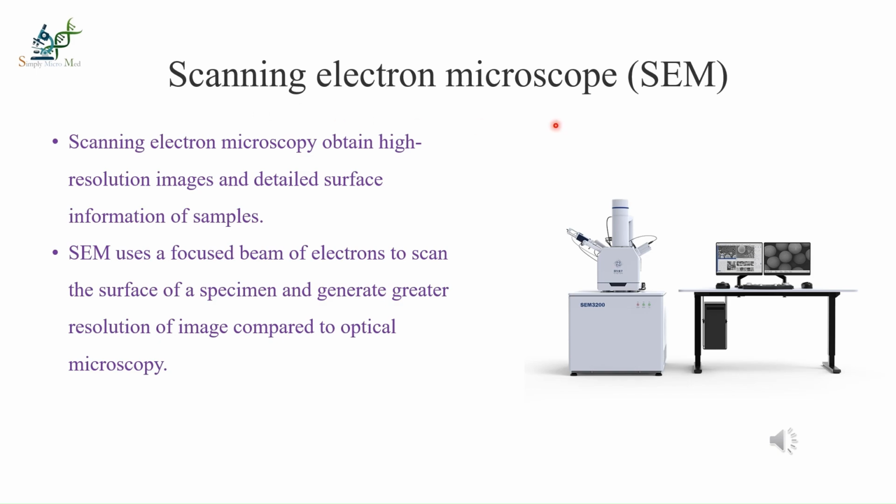Simply, we can say that this microscope will scan the specimen, so we can observe a high quality, greater resolution image.